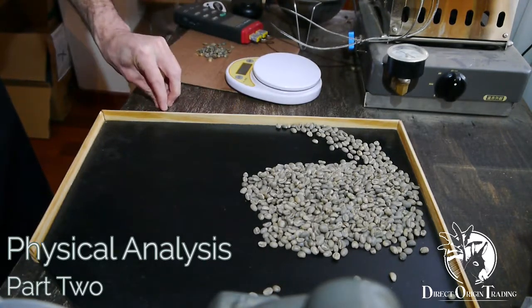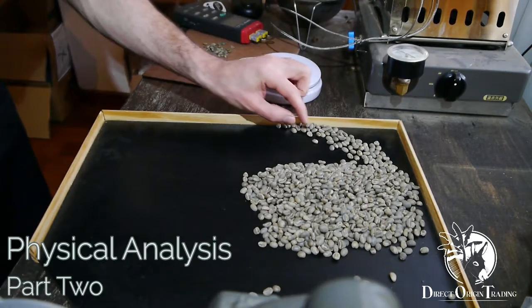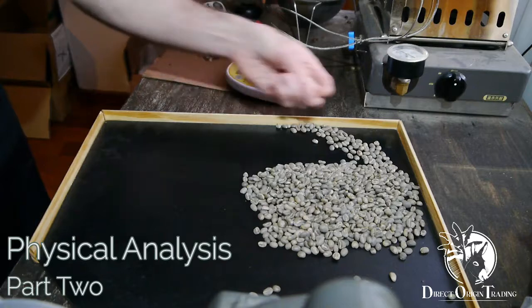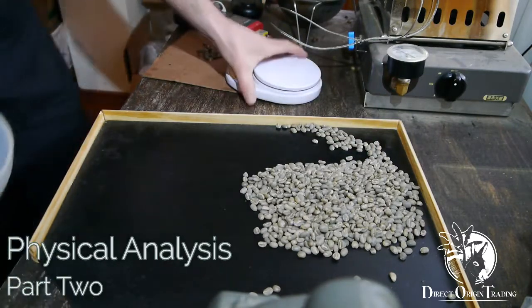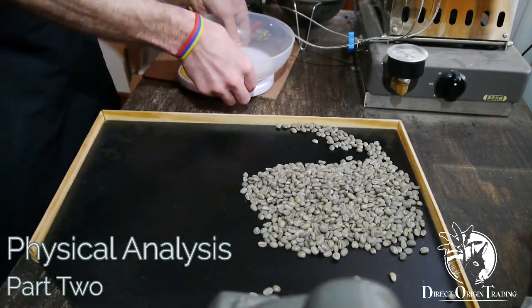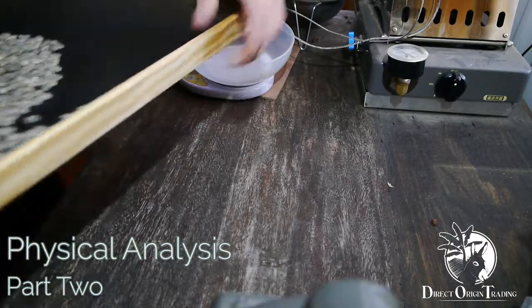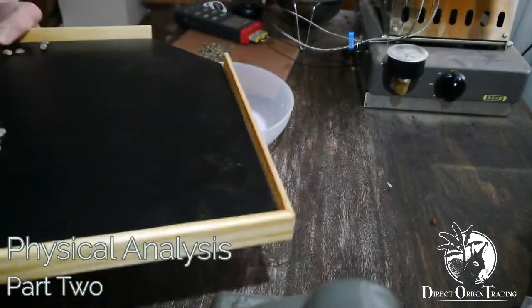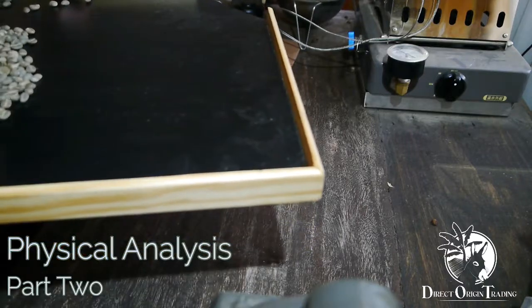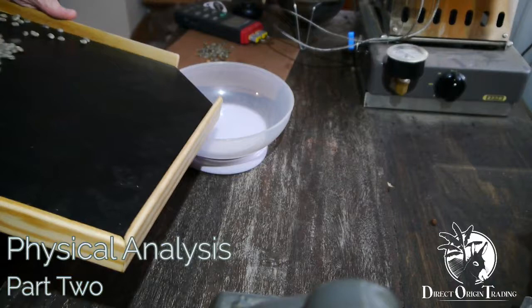I think in this sample there was one black bean, so group 1 defect, much more serious, but nothing that a pass through the color sorter wouldn't take out for us. So it's a very good quality green coffee, parchment coffee that is, so it would not be any problem at all to get a very high grade green coffee out of this. So let's find out exactly how much.